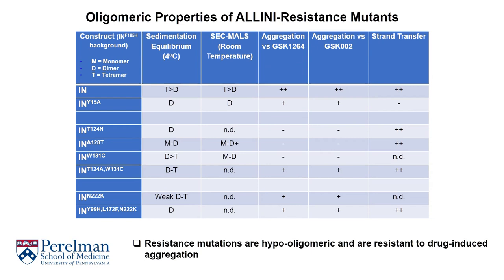To test this, we went back to our solution biophysical methods, including SEC-MALS. We introduced these resistance mutations into our expression construct, purified the proteins, and then characterized the resulting oligomeric properties, the activity of the integrase, and their respective susceptibilities to drug-induced aggregation. Shown are the results in tabular form.